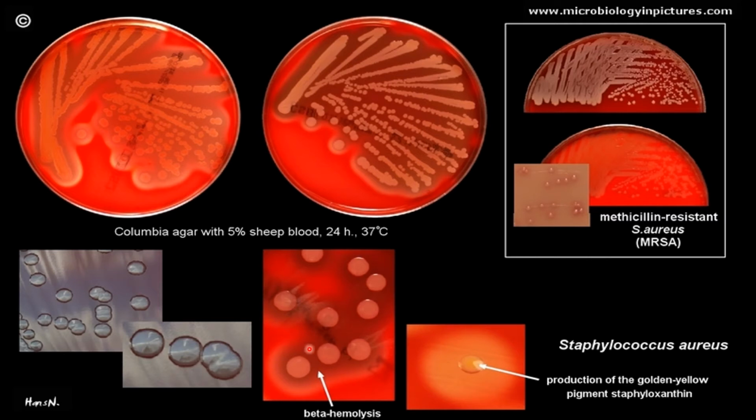So here we have beta hemolytic Staphylococcus aureus, and some Staphylococcus aureus, like this methicillin resistant Staphylococcus aureus, they are not hemolytic.